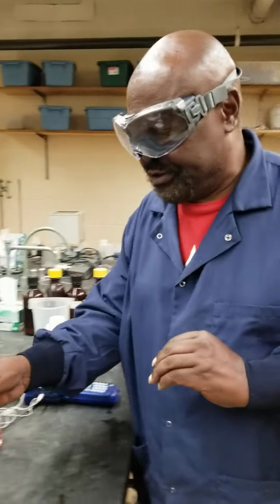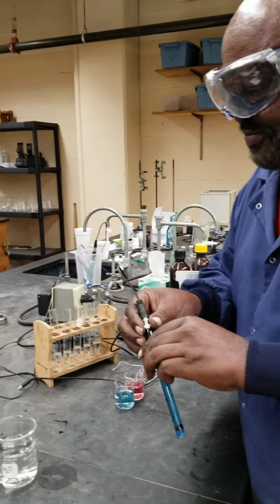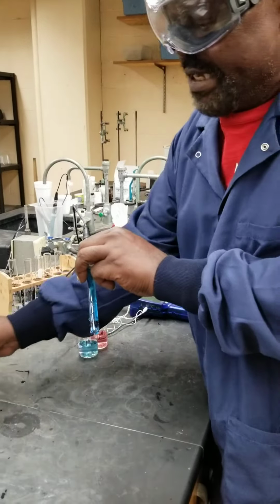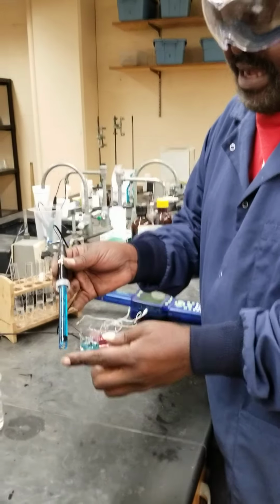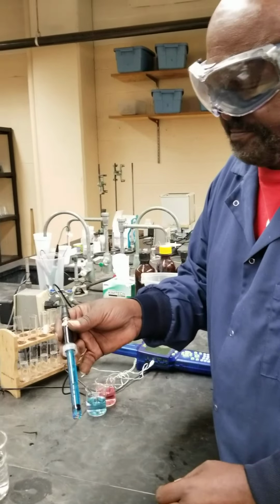pH electrodes. Here's one, brand new. It comes in a protected solution. The reason is so that it doesn't dry out. So this is the cover, so when I'm done, I'll put it back and lock it back there. It needs to be wet and remain that way.